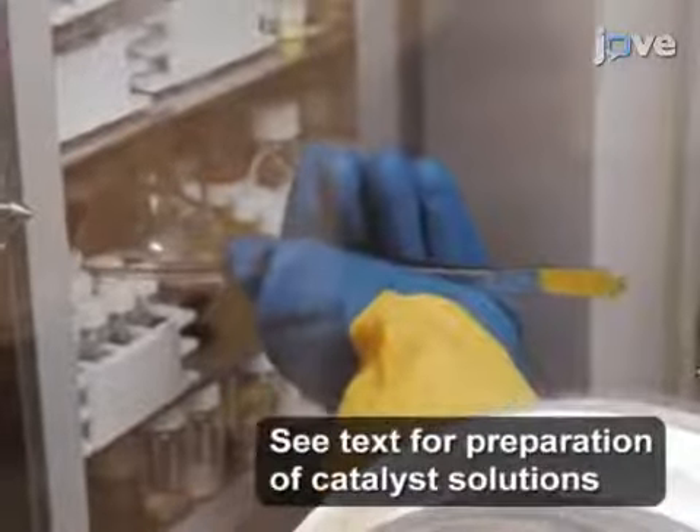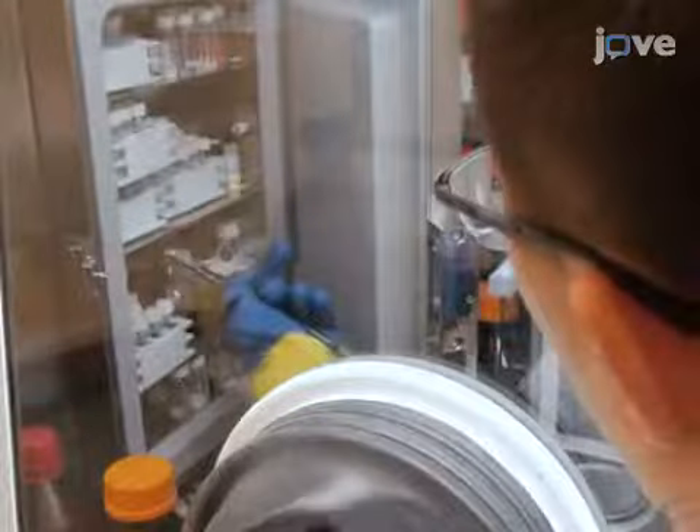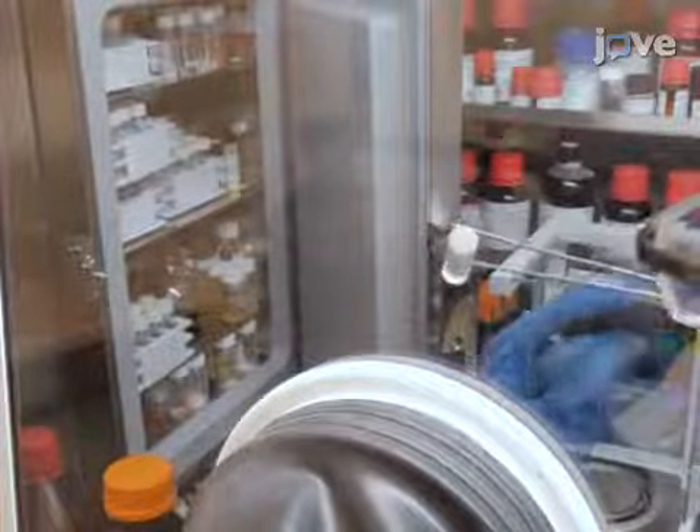To begin the procedure, prepare solutions of Bipy-Nickel-Cod, Zinc Bis-HMDS, benzyl alcohol, and the iridium catalyst in anhydrous THF. Store the solutions at minus 35 degrees Celsius.